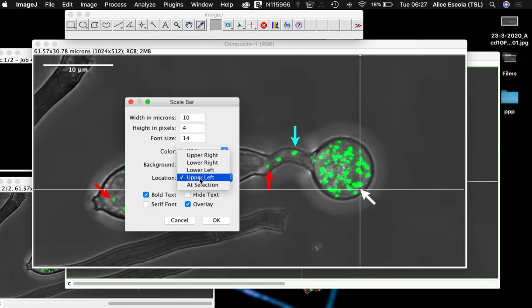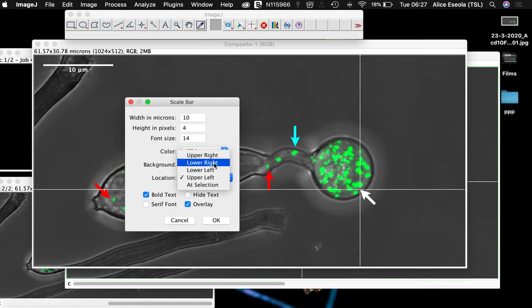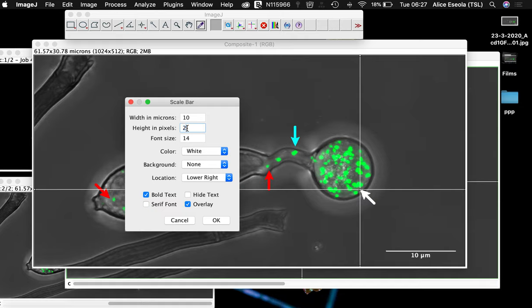I'm going to be choosing lower right there. You can see that the scale bar is really thin. I like to have a very thick scale bar, but not one overshadowing my sample. And I will hide the text.